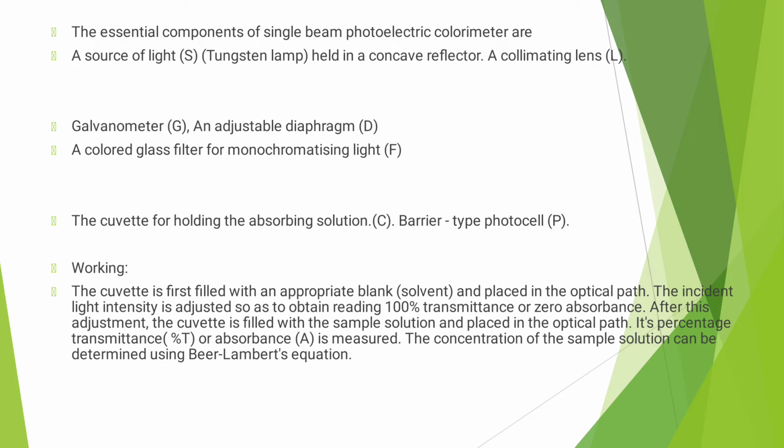Adjust this 100% transmittance or 0% absorbance by placing the appropriate blank solvent solution in the cuvette and into the optical path.